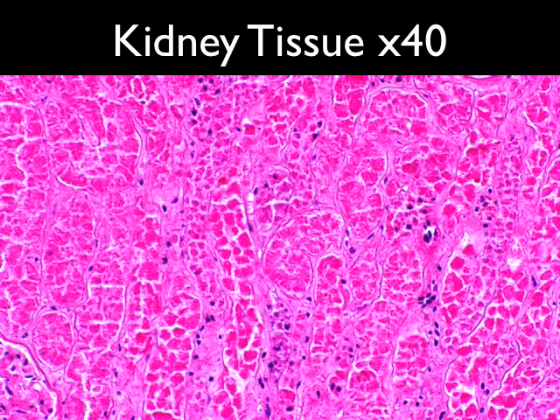It's got to do with sectioning again. Different sections, at the other side. Yeah, I think what you're saying is, if this is a muscle growing up like this and there's another muscle growing that way, when you section through this way, you're going to get all the muscle fibres growing up the body, but if there's a muscle going that way, you're going to be cutting along the side of the muscle. So that's all it is.